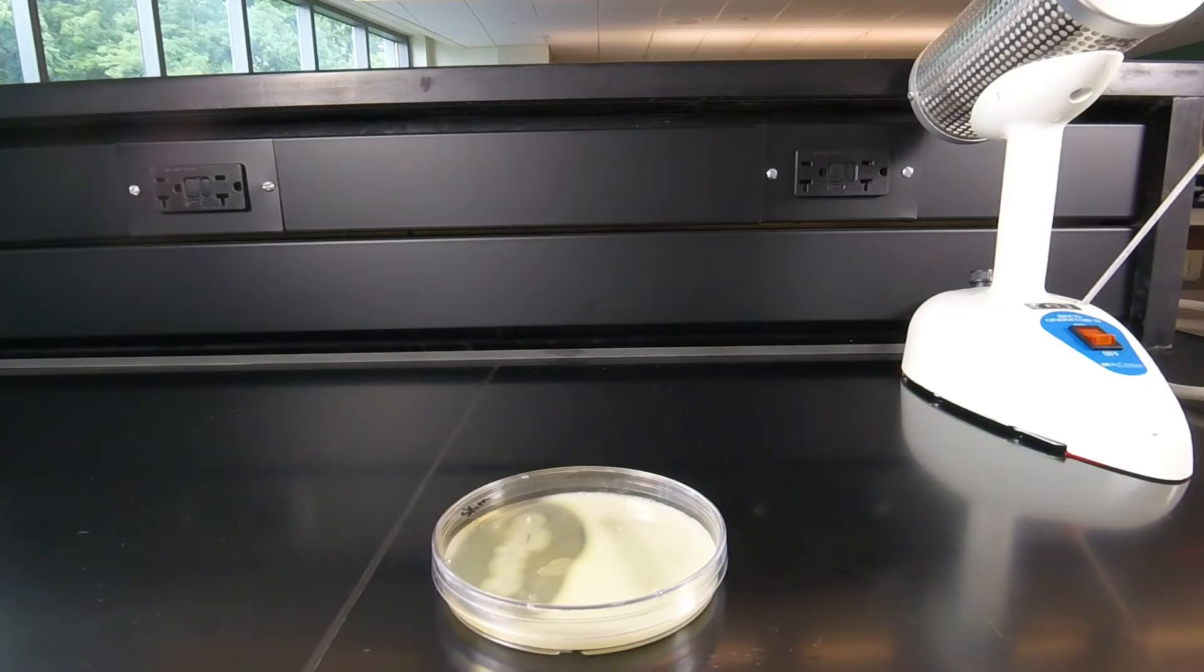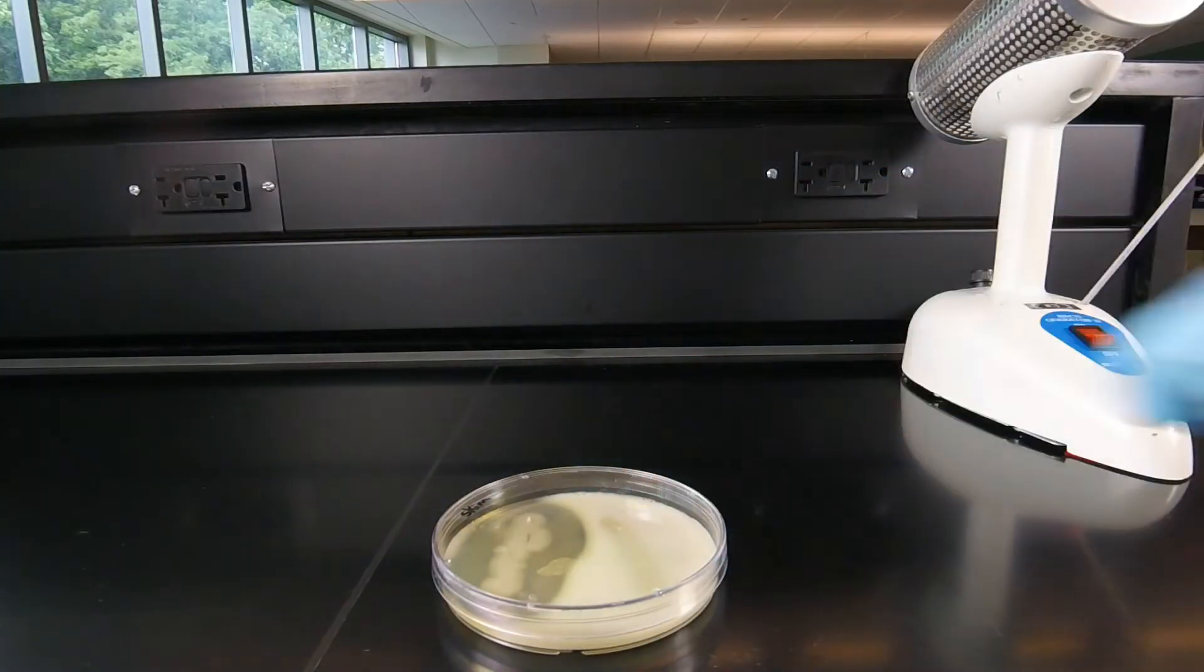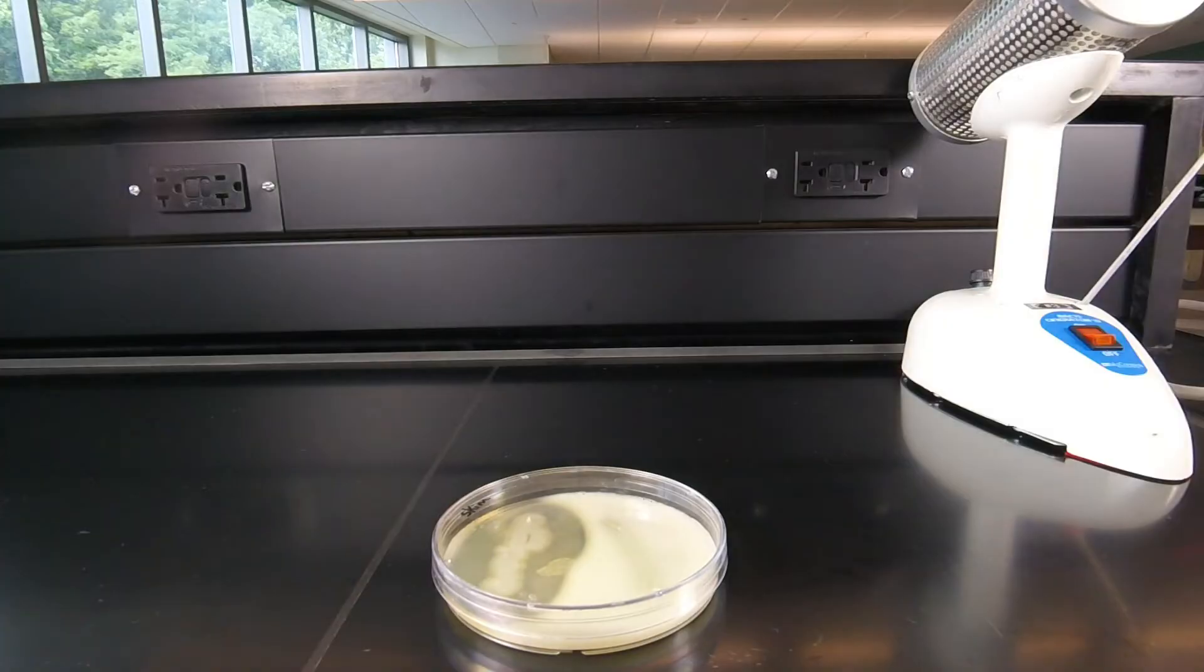Now when the plate was inoculated, you streaked two single lines down the plate with the two different bacteria we were testing. The plate was then incubated and now we can see the results.